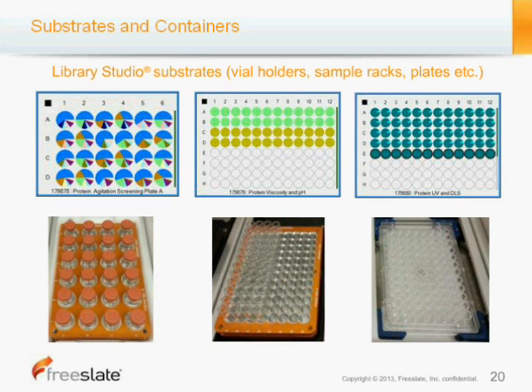And then next to that, we have 8x12. This is a 96 well 1 milliliter vial plate that's used for aliquoting material for analysis, for instance. So in this case, you can see it's protein viscosity and pH can be measured in such a plate. And then we also have 96 well plates that can be used for UV and DLS. So this is sort of how it looks in reality versus how it looks in silico.